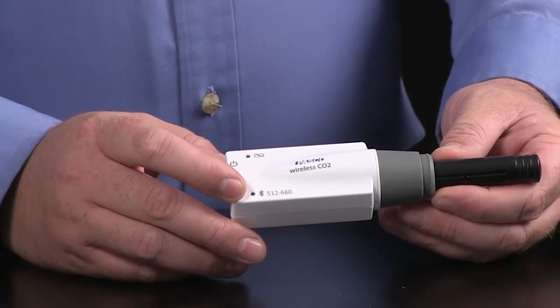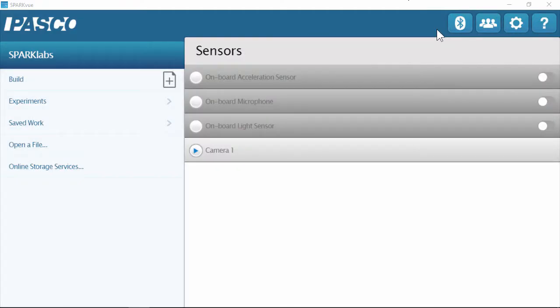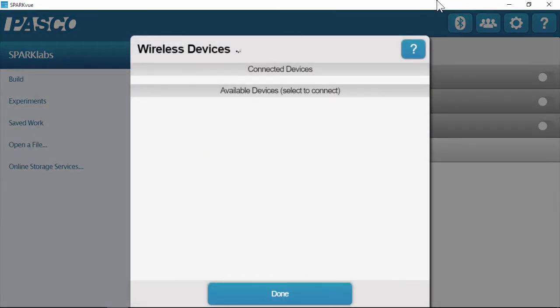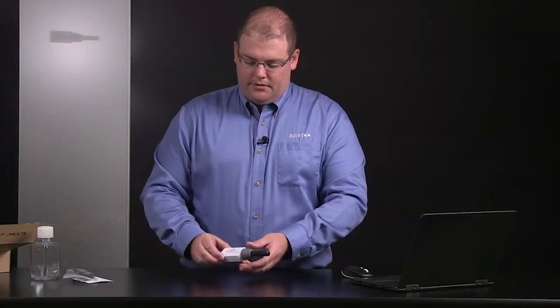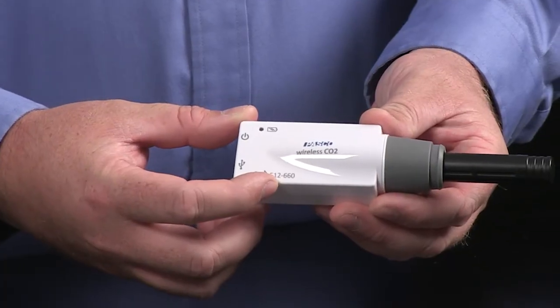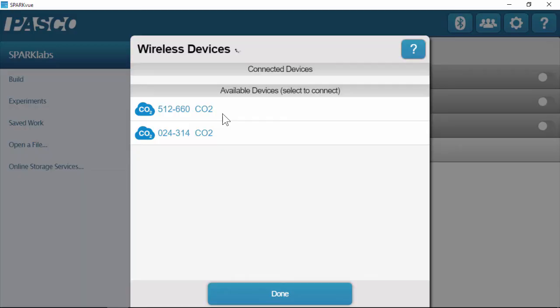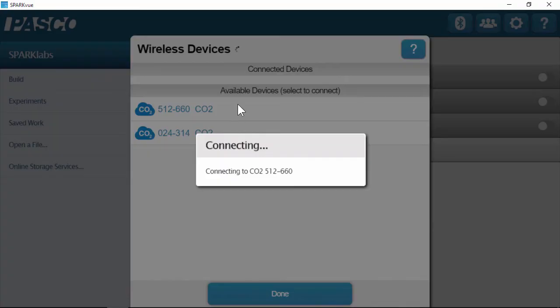Notice that the Bluetooth LED is blinking red, indicating that it's ready to pair. I'll launch SparkView and open the Bluetooth menu. My sensor should be at the top of the list. We can also match the six-digit ID number found on the sensor. I'll select that sensor to connect.